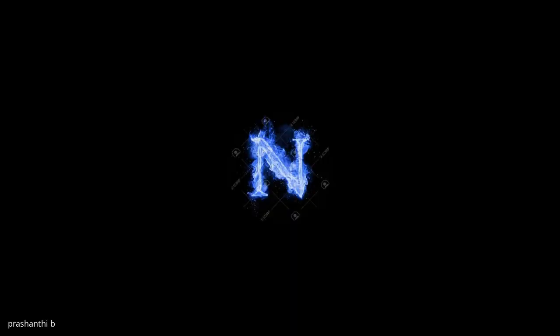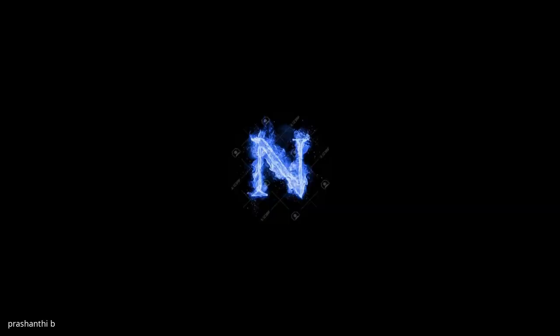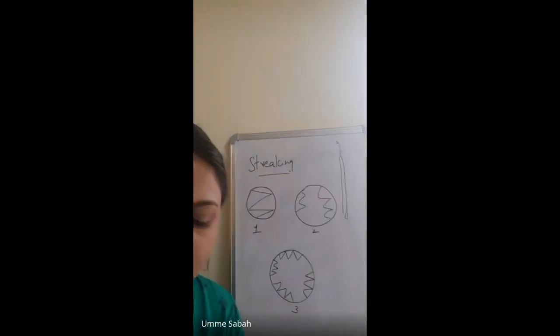These streakings will help the organisms to grow in that particular fashion? Yes, very good. Who said this? Prashanti, ma'am. Good, Prashanti. So if I've taken Aspergillus niger in my loop and this is the way of my streaking, it will grow there only. It will not come out. If I've taken a rhizobium and I have streaked here, it will grow there only. And when they grow, the colonies are in different colors and the plates look very beautiful. For any microbiology student, if the plate looks beautiful, clean and neat with a variety of organisms, that is success for her. They feel so happy.